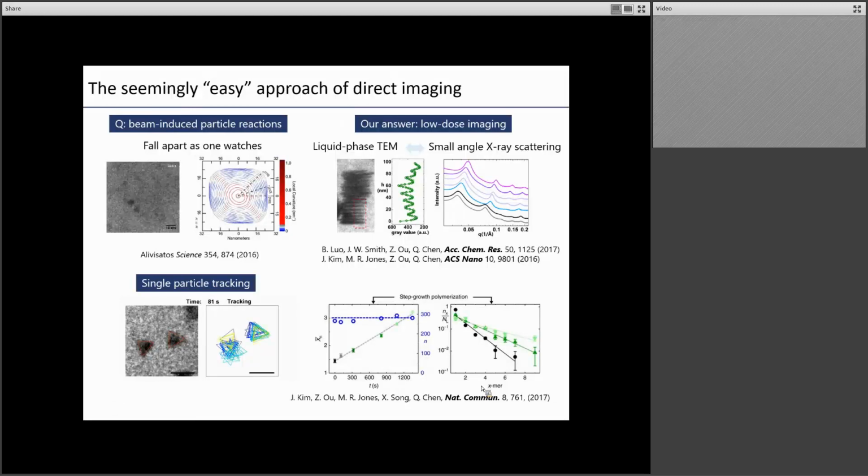where liquid phase TEM to us is no longer just a fancy tool to study mysterious dynamics unique to a confined, beam-intensive environment. Instead, it can really be related to practical experiments outside TEM. It can validate established theories and really provide meaningful guidance on our experimental efforts.